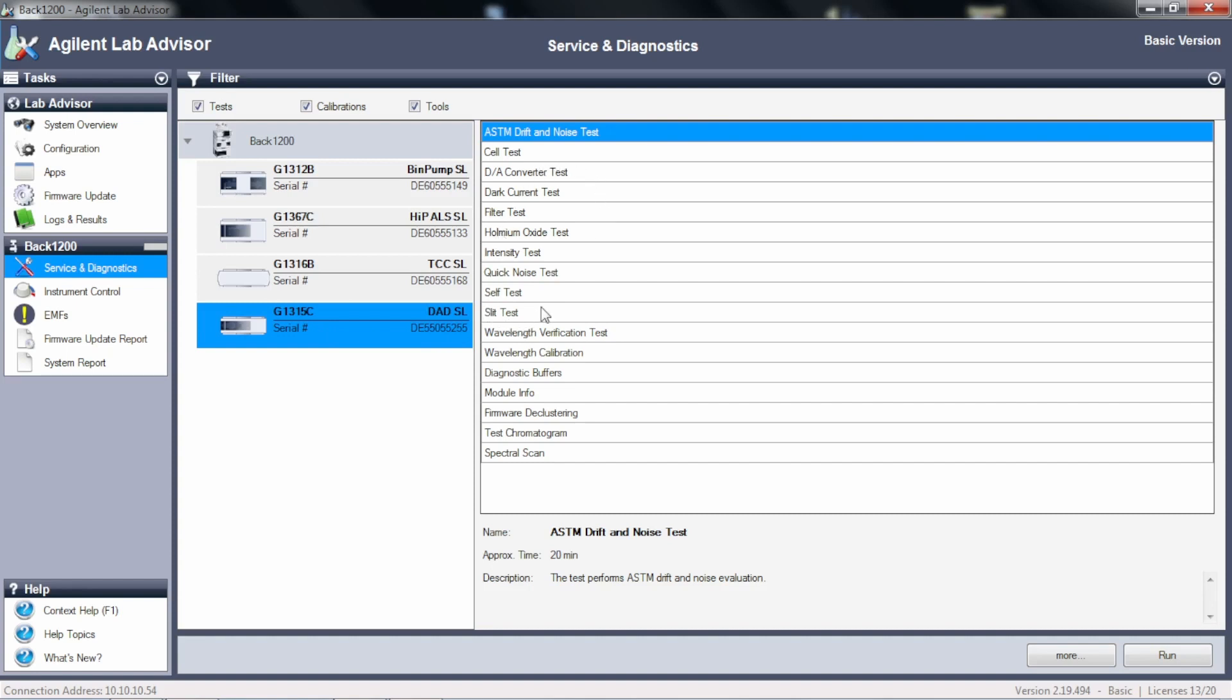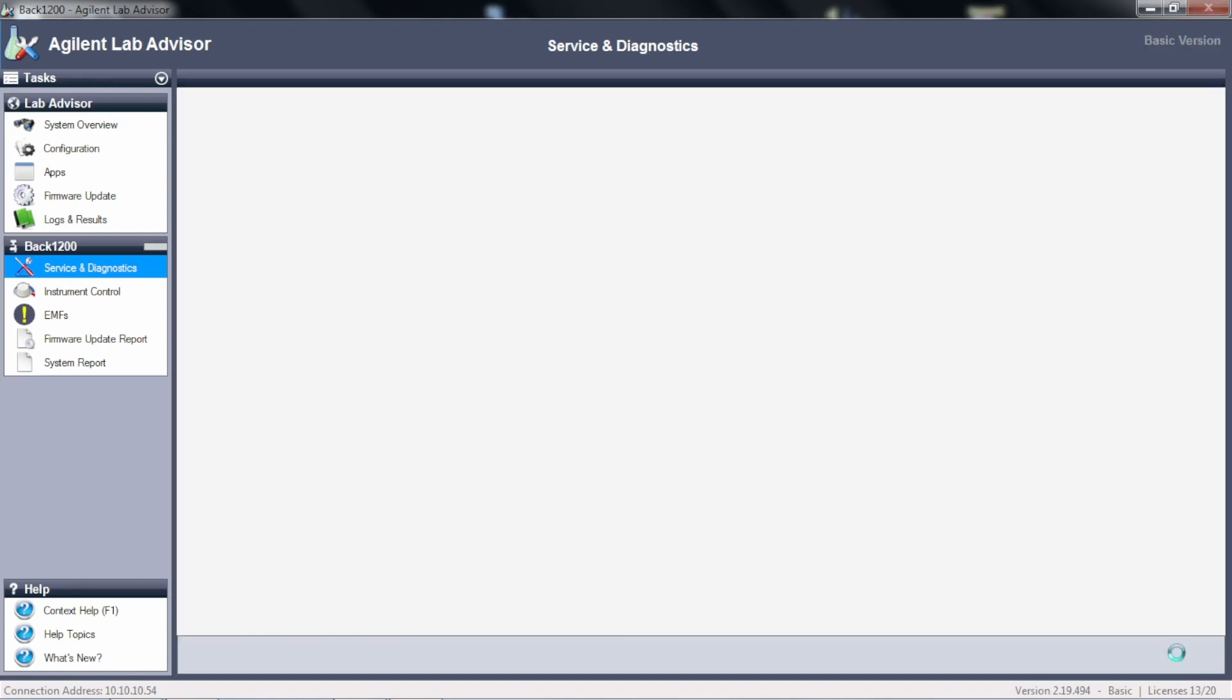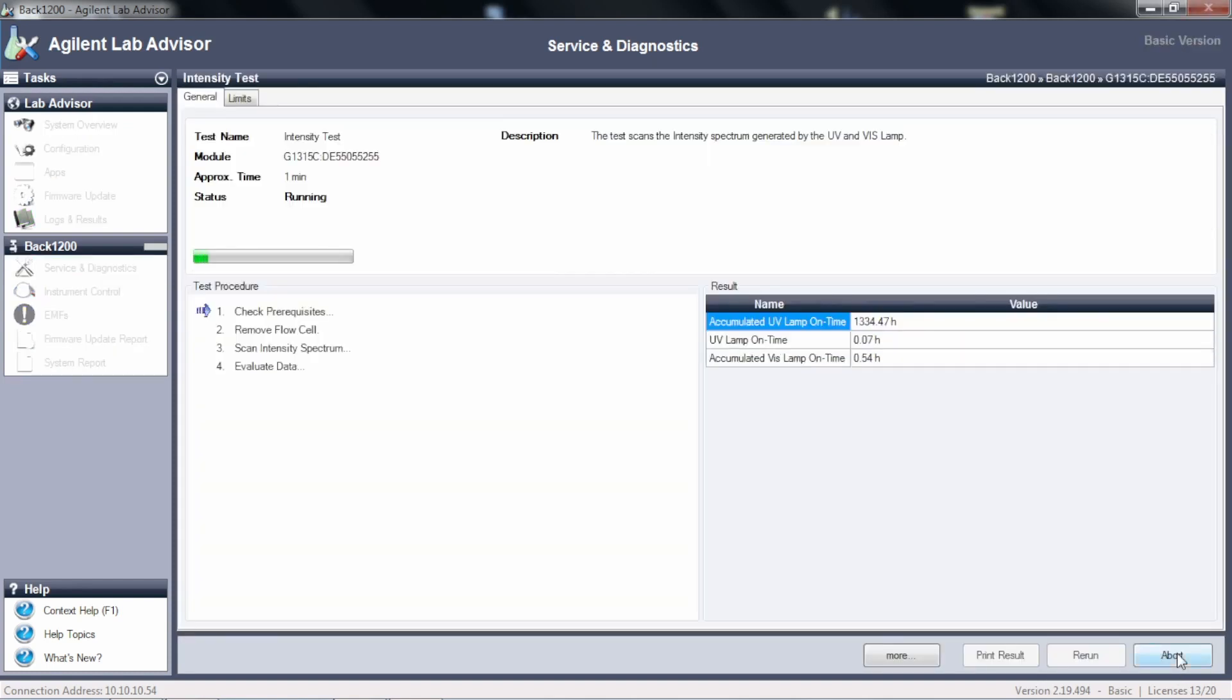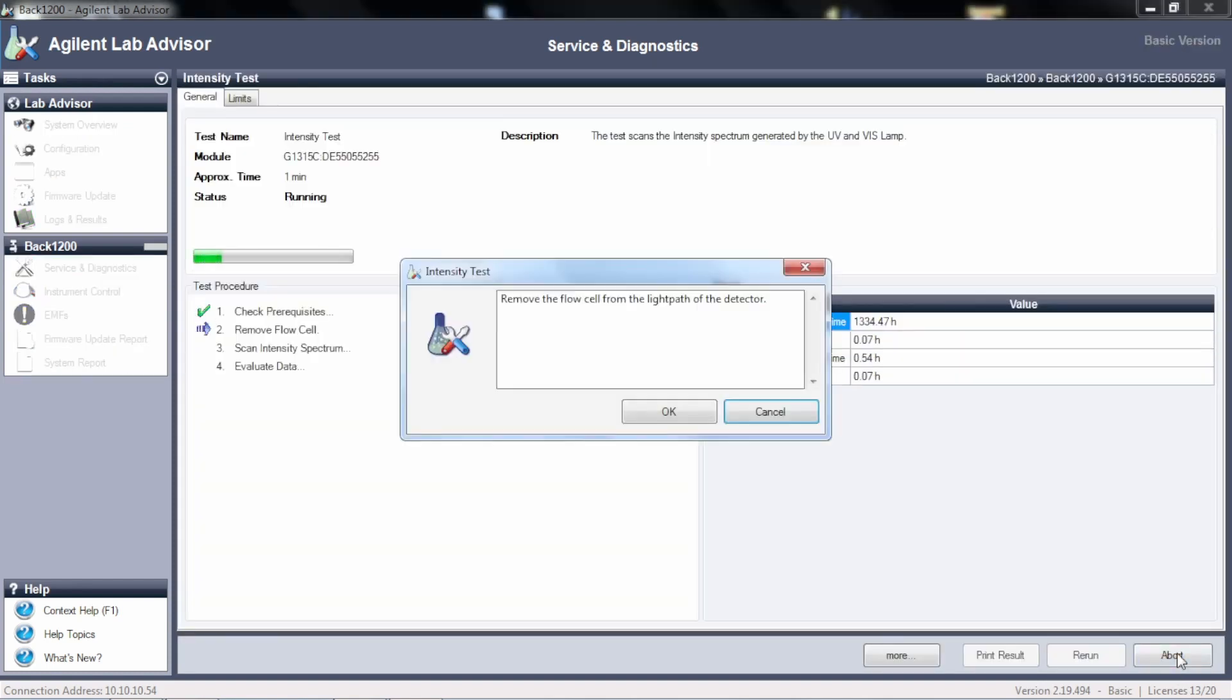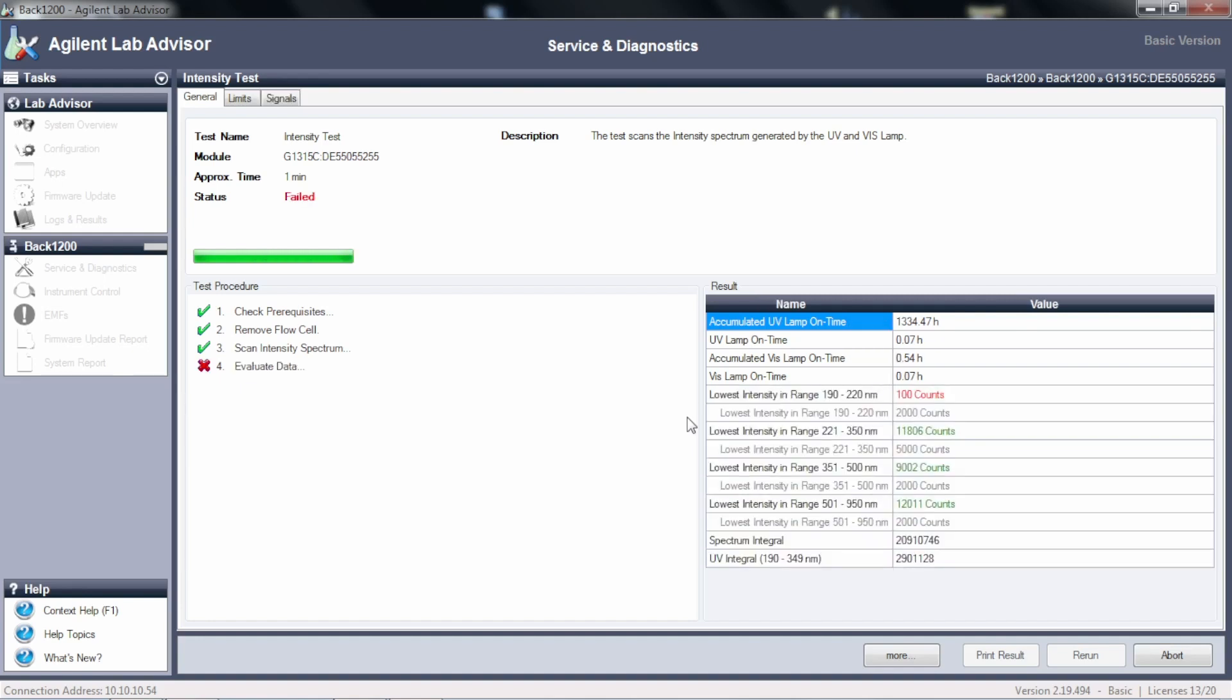So we're going to run the intensity test, just like we just ran. I'm going to run it twice. I'm going to leave the flow cell in place. It's telling me to remove it, but I'm just going to say okay. It doesn't know I didn't take it out. And this way, I'm going to set this up the same way we did last time, and we'll be able to check how good our lamp is and how clean our flow cell is. So the first one is with the flow cell in.